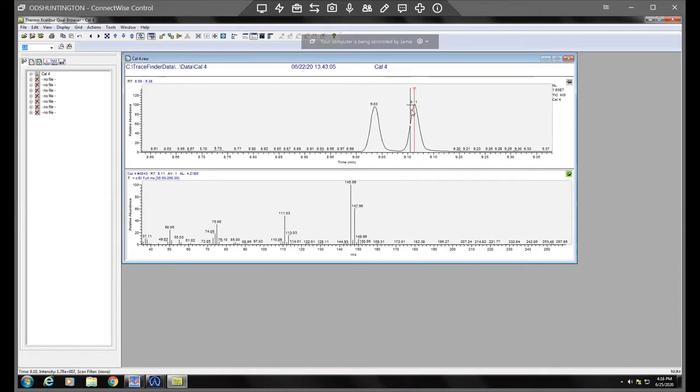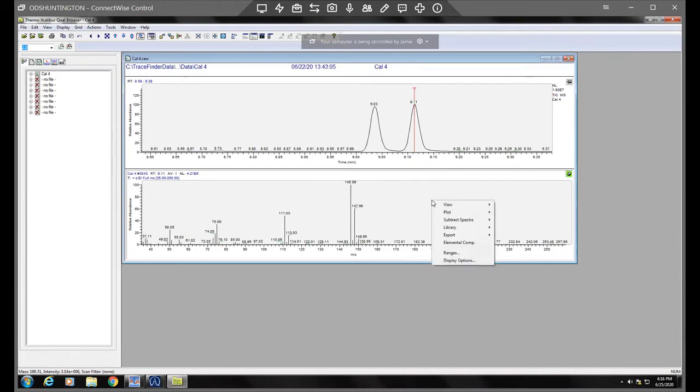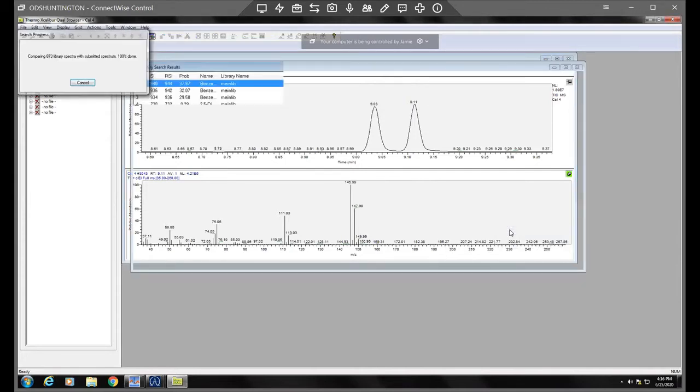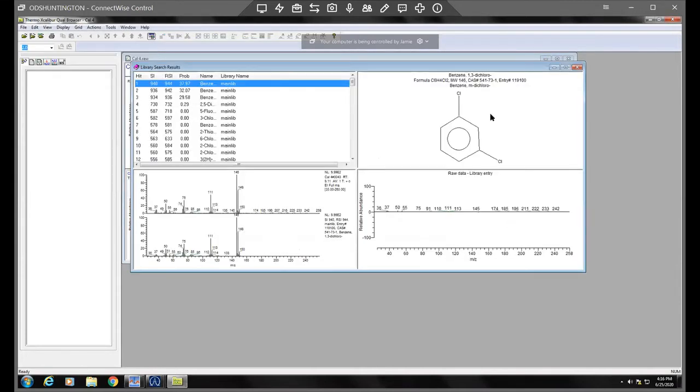I've selected this spectra and I'm going to come down here and I'm going to right click and I'm going to go to library and search. And what this will do is pull up the results against the NIST library.